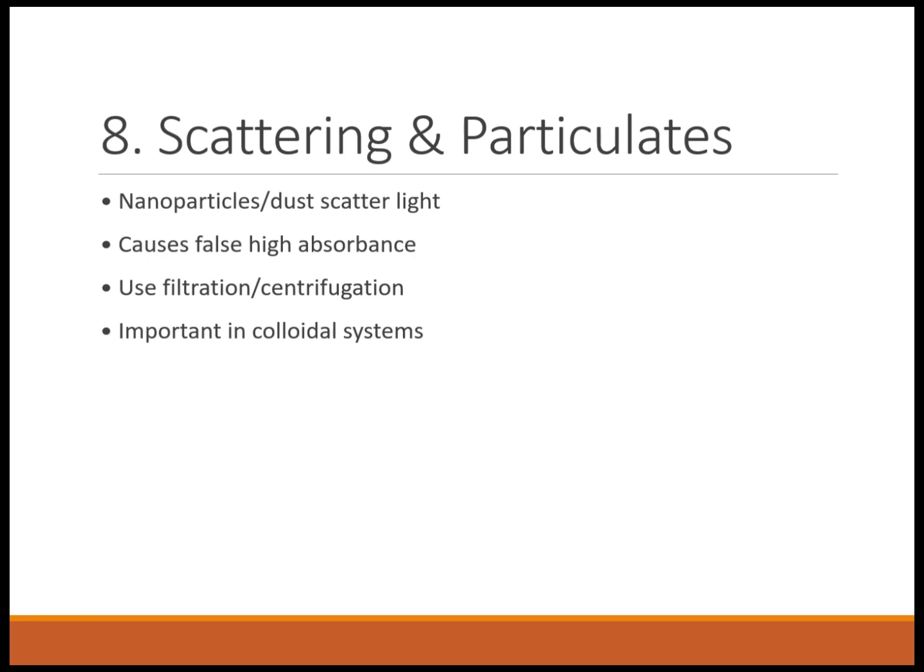Scattering and particulates. This is also an important factor while describing the factors affecting the results in UV visible spectroscopy. In this case, particles, dust, bubbles or aggregated nanoparticles scatter light.